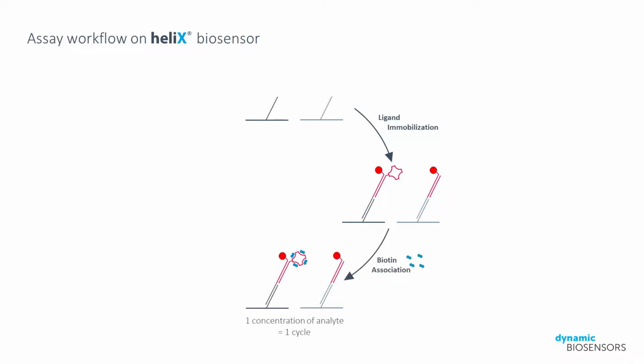First, we immobilize our streptavidin ligand strand on spot 1 and our ligand-free strand on spot 2. With our nanolevers prepared, we can then introduce our analyte, either biotin or biotin hydrazide, in the association phase. Then we will dissociate our analyte over the dissociation phase, which in this case will be 12 hours. Once we have completed the dissociation phase, we can then regenerate our surface to start another cycle.